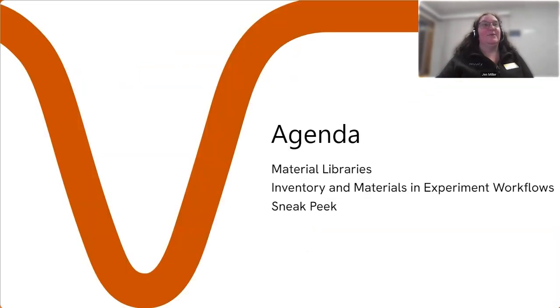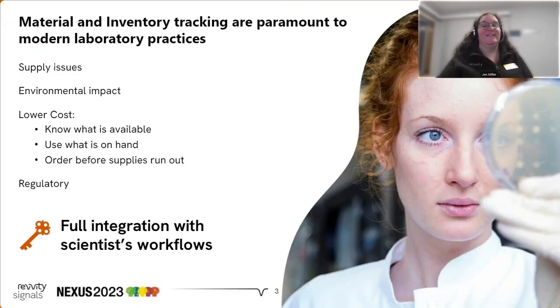I'd like to extend a warm welcome and thank you for your interest in my presentation about streamlining laboratory inventory management. Some main topics that we will be reviewing today are material libraries, how inventory and materials are used in experiment workflows, and finally a sneak peek at our future functionality. Material and inventory tracking are paramount to modern laboratory practices if full integration with scientific workflows is implemented.